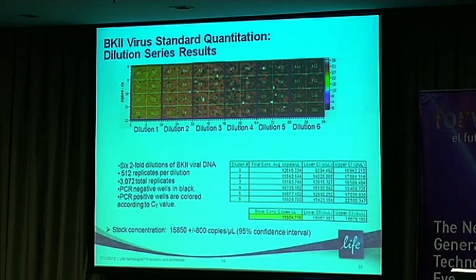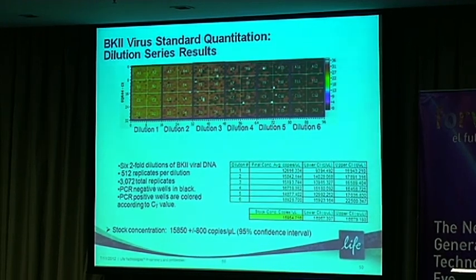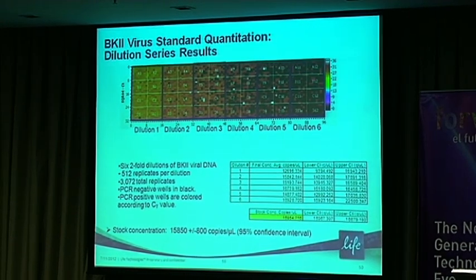And basically, they wanted to be able to determine if they could get an accurate count of how many copies of this target we actually have per microliter. Don't focus on the numbers here, but if you look up here on the left-hand side, we obviously have a problem, right? What I said before was that in order for digital PCR to work, you have to start seeing negative wells, no copies showing up, in order to be confident in this.